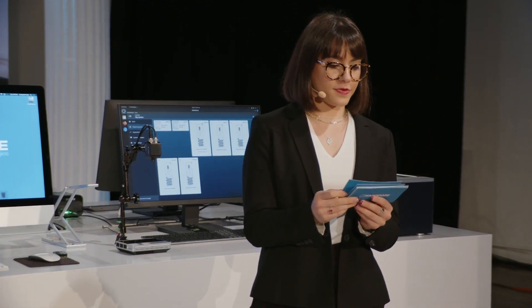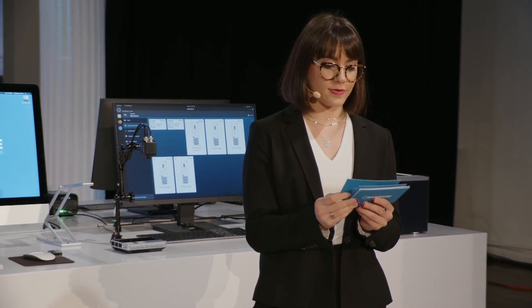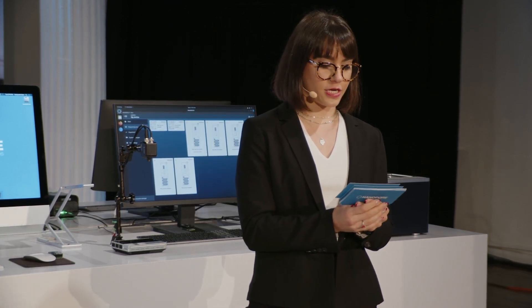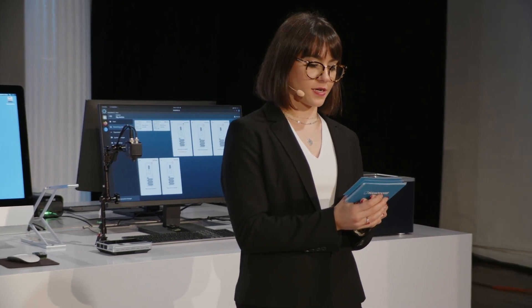Now that we've gone through sample preparation, following the end-to-end protocols, and sequencing with the power of PromethION, it's time to discuss analysis. To introduce our analysis suite for human genome protocols, I'd like to welcome Steven Rudd, Associate Director of Bioinformatics Product, up to the stage.